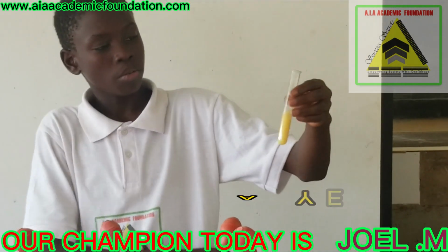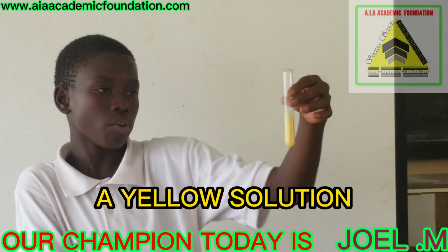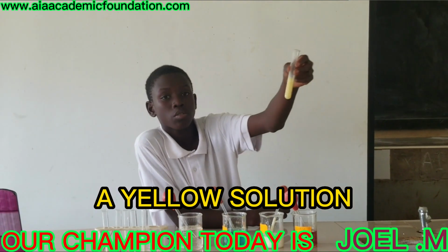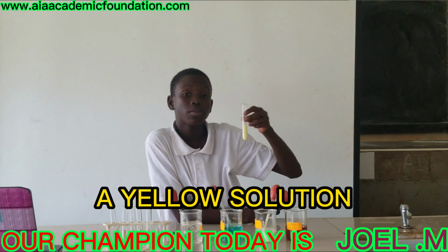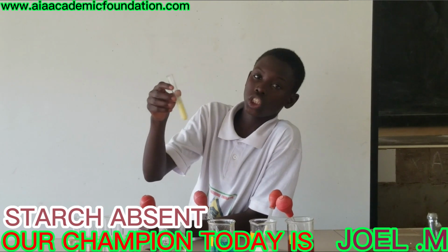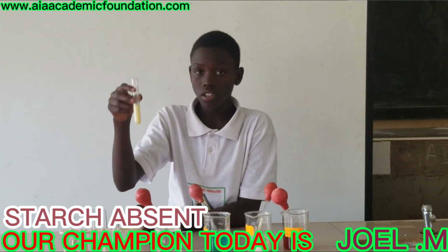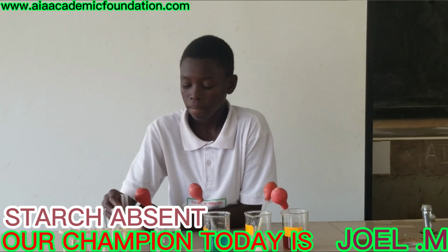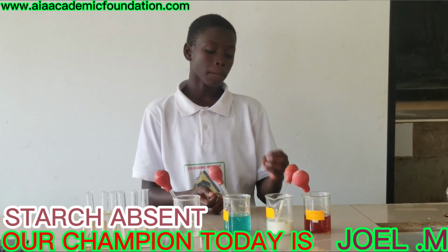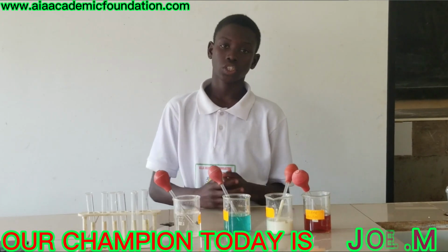So once we add some drops of iodine, we have got a yellow solution, which means that there is no starch in milk. If there was starch in milk, the solution would have turned black. So in my conclusion, I have tested that milk contains proteins, but it does not contain starch.